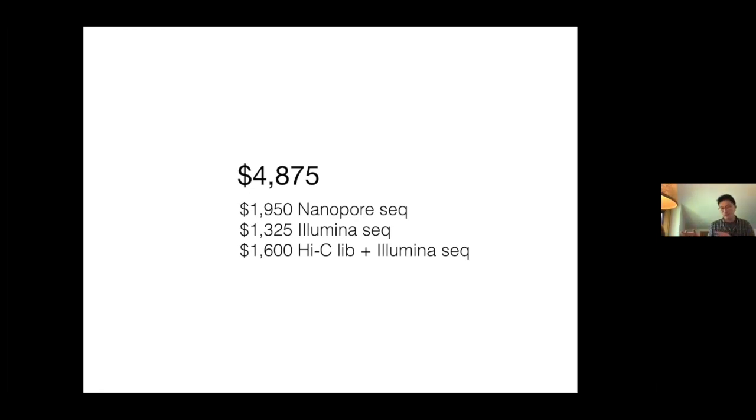It can be difficult, but it can be easy. It depends on your genomes and the data you generated. So I cannot say it's easy or difficult, because that depends on the organisms you're working with, the initial assemblies, and your Hi-C libraries. Okay. Thanks. I hope that answered your question.